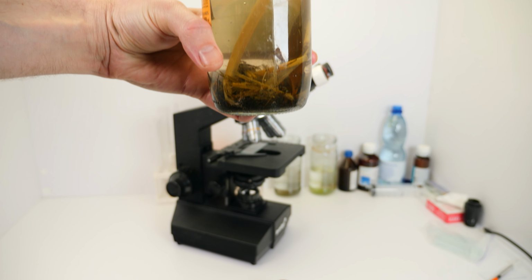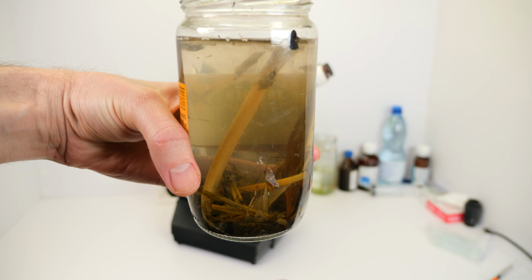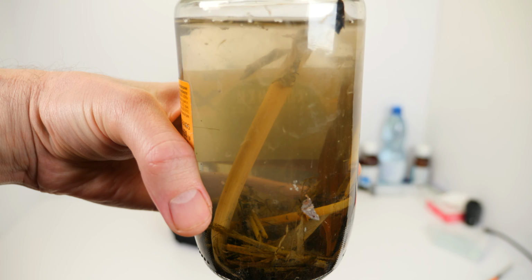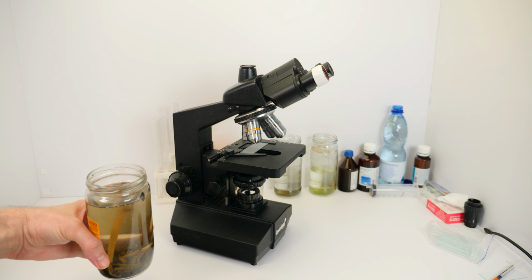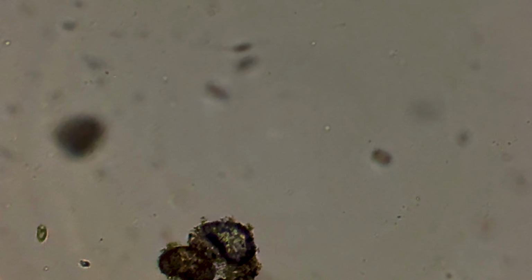Let's watch what happens. Okay, here's our water sample. I collected this from a stagnant pond a few days ago. Stagnant water might look gross to us, but under a microscope, it's basically a tiny universe. Ponds like this are usually packed with all kinds of microorganisms. Some swim fast, some barely move. Some look like they're spinning in circles for no reason at all.